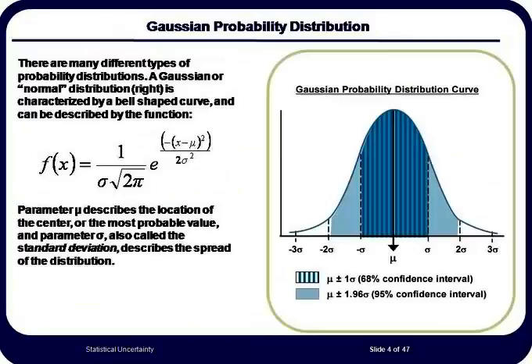As shown on the figure, if we take the area under the curve that is encompassed by the mean value plus and minus 1.96 sigma, 95% of all results will normally fall into this range. So if the mean were 10 picocuries and sigma was 1.0 picocuries, then the range of values that would correspond to 95% of the possible measurements would be from 10 minus 1.96 picocuries to 10 plus 1.96 picocuries, or a range of 8.04 to 11.96 picocuries.